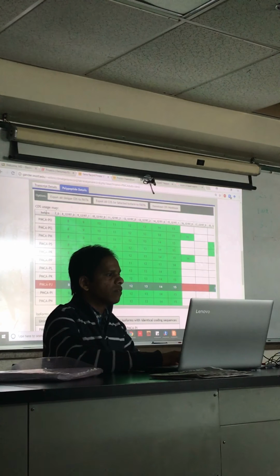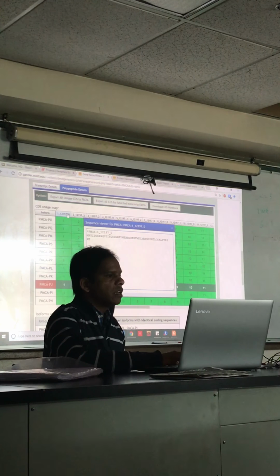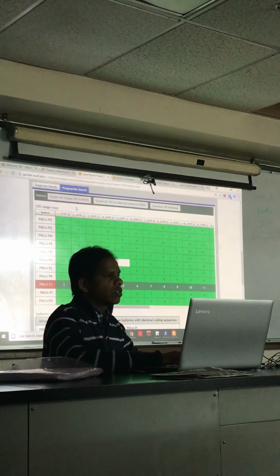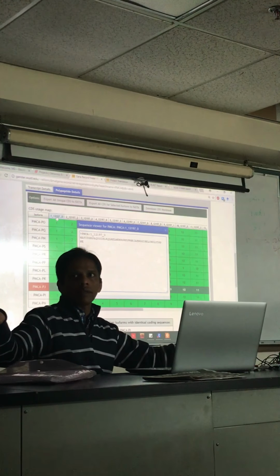Now, if you click on any of the exons of an isoform, it will show the protein sequence. For example, I want to see exon 1. If you click on exon 1 in the column, you see the amino acids it codes for. So if you click on the column at the top, it will show the amino acids that exon codes for. Exons are like coding sequences, right? Exon 1 will code for a specific portion of a protein.